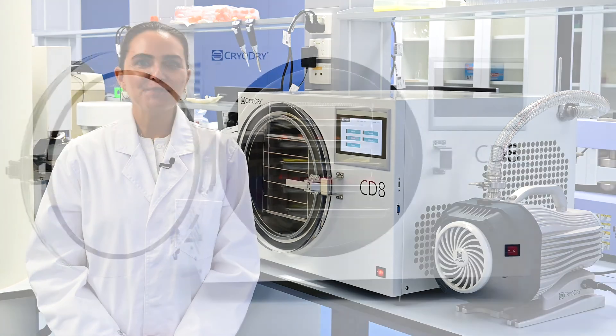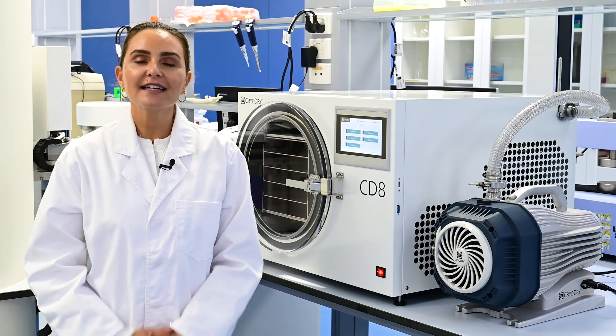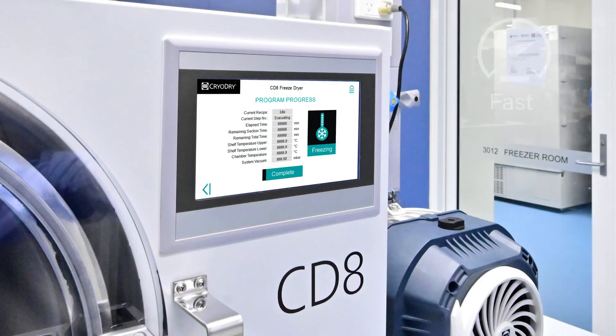Introducing our new benchmark freeze-dryer, the CryoDry CD8. Our freeze-dryer is an all-in-one solution that's easy to load and it's fast.